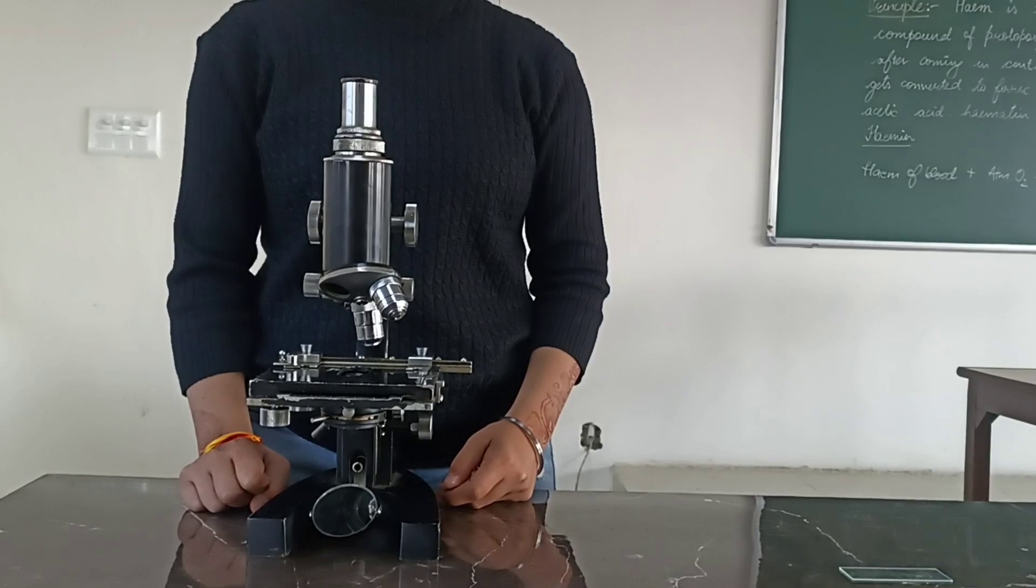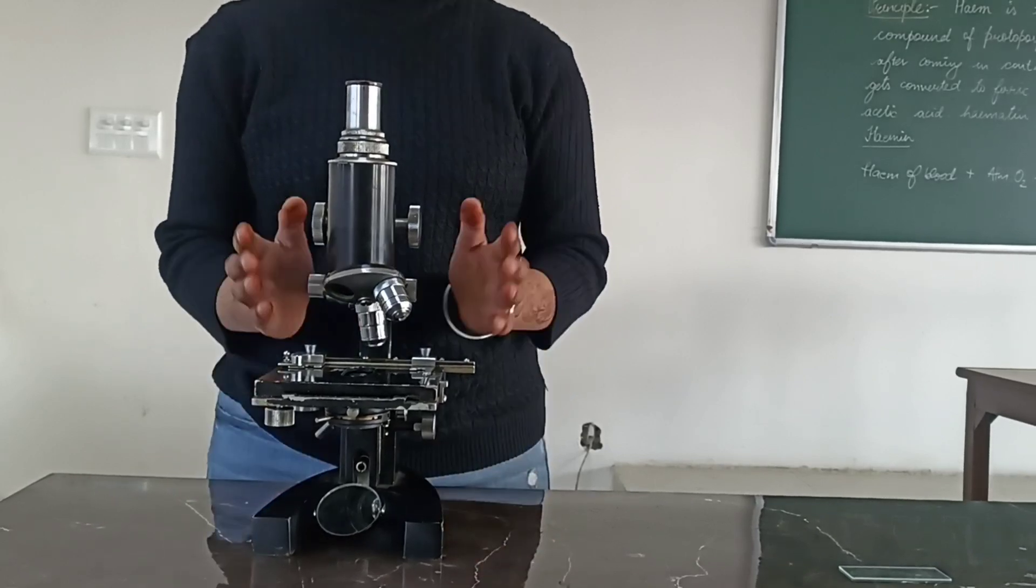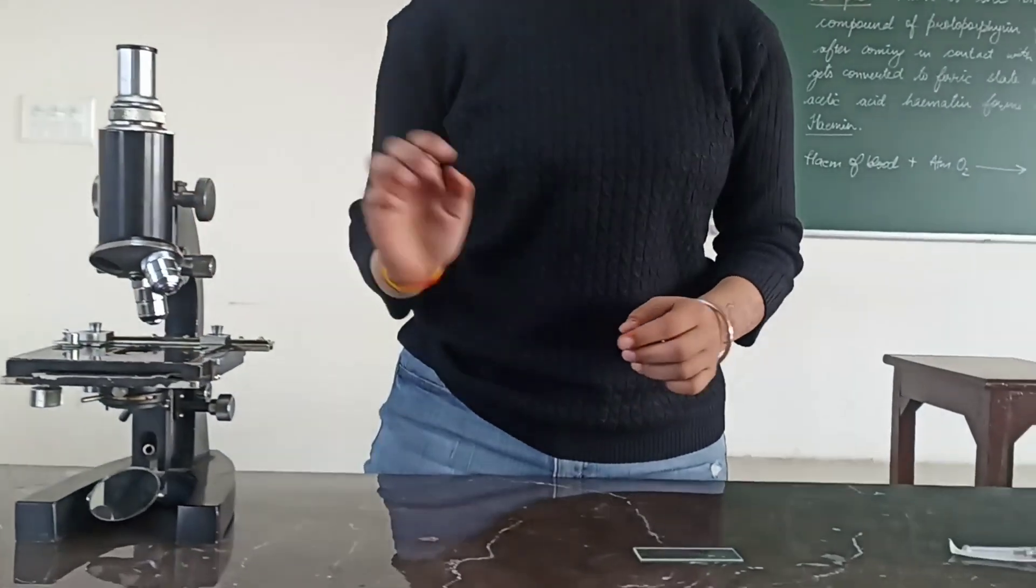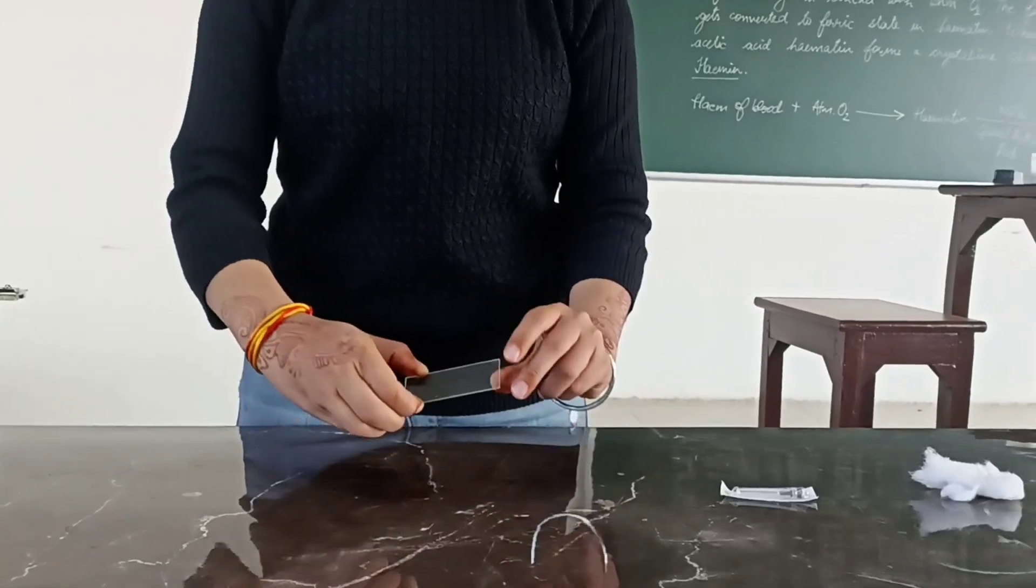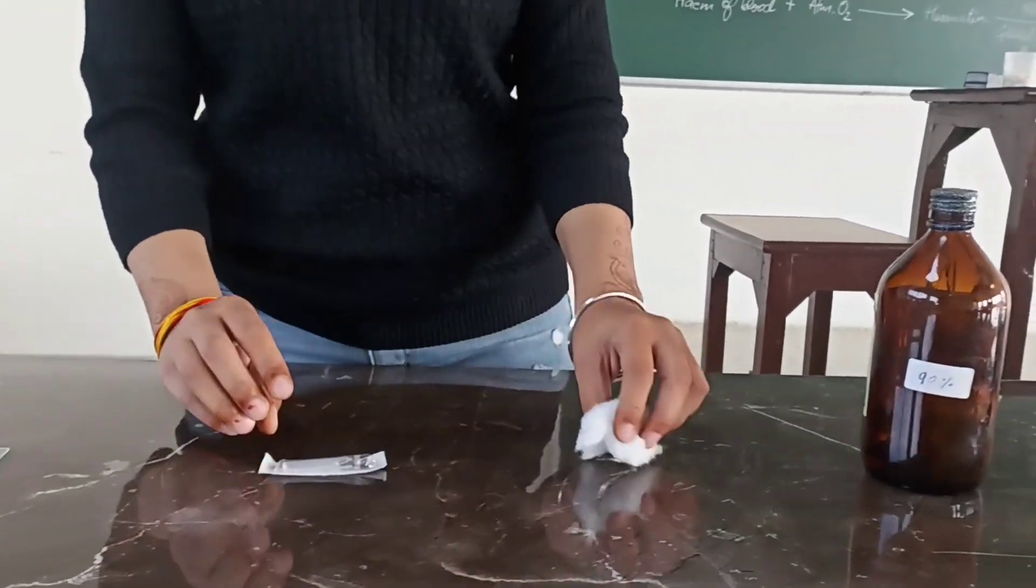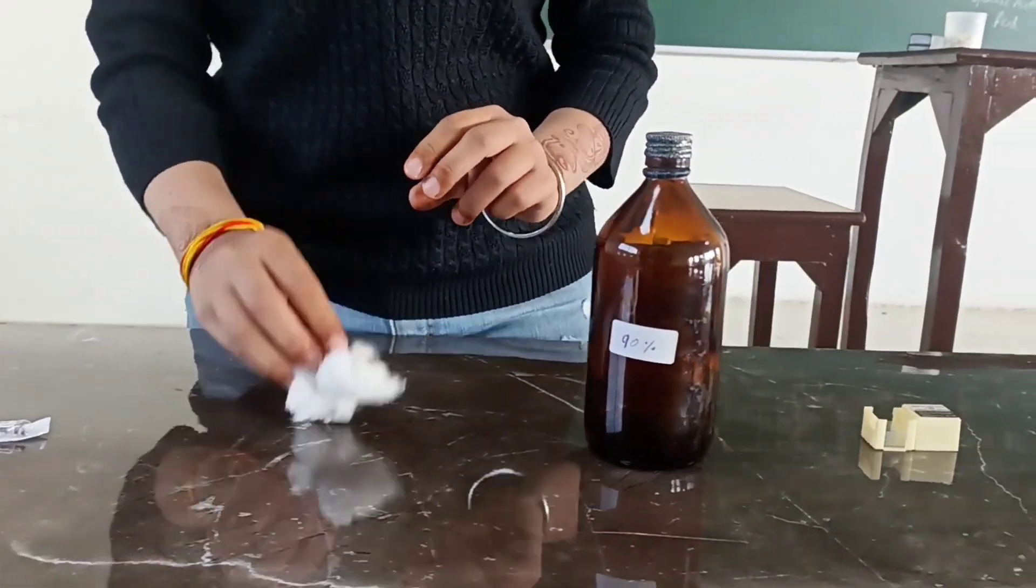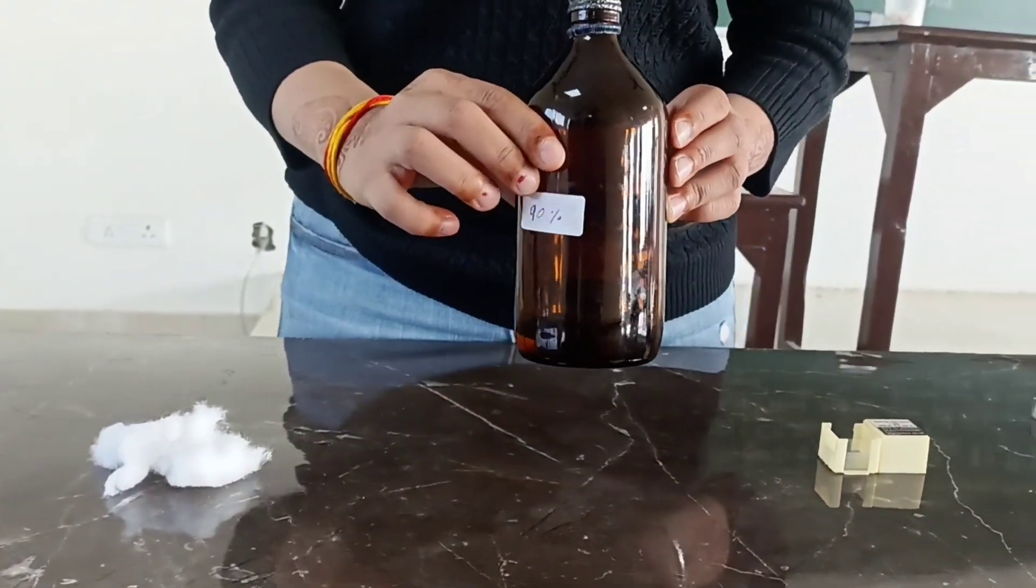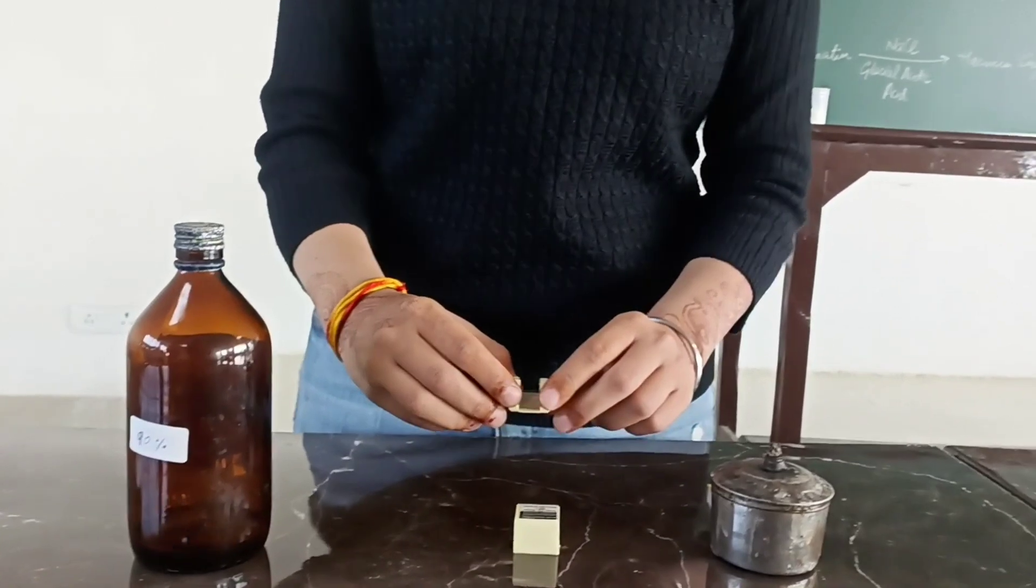Now let's see the materials required. We need a microscope, a slide, a pricking needle, cotton, 90% alcohol, cover slip, and a burner.